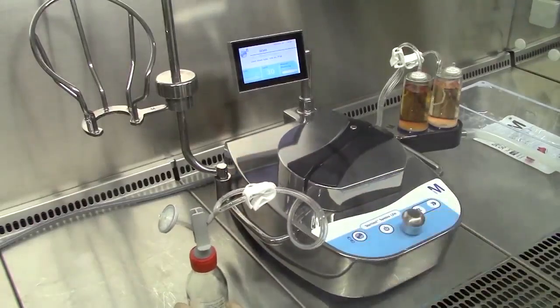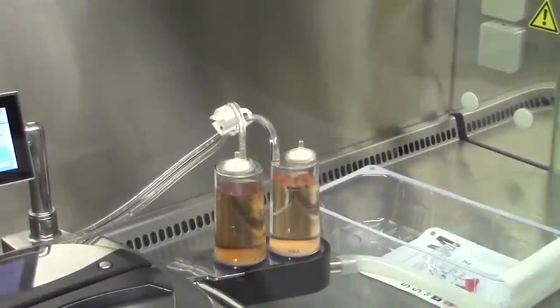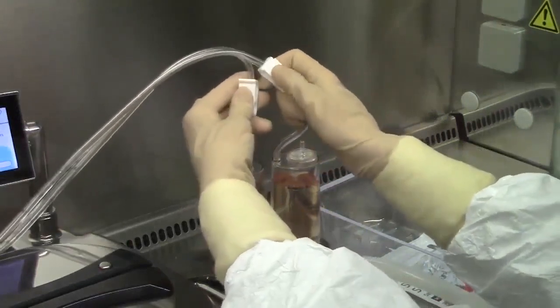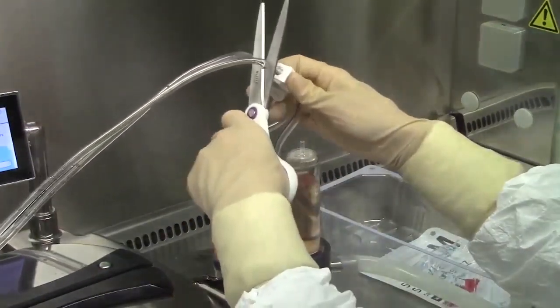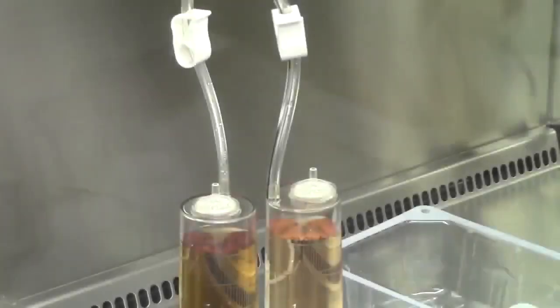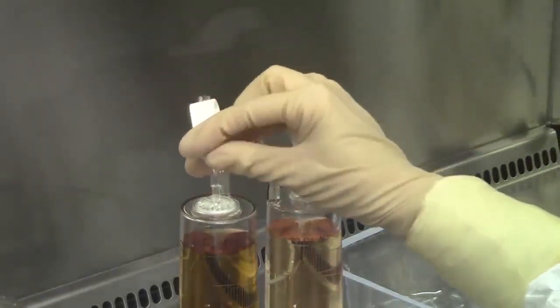Open the pump head. Remove the tubing from the pump head. Using the clamps located on the canister side, clamp off both tubing lines approximately 8 cm above the canister inlets. Cut the tubing approximately 2 cm above the clamps using sterile scissors. Be careful not to cut the tubing where droplets remain. Bend the tubing and connect the cut end to the luer slip of the vent on each canister.